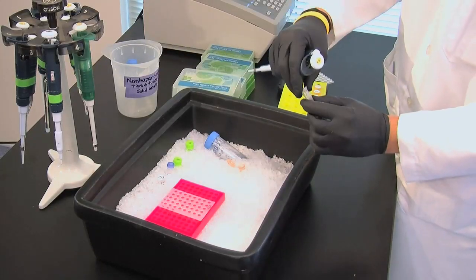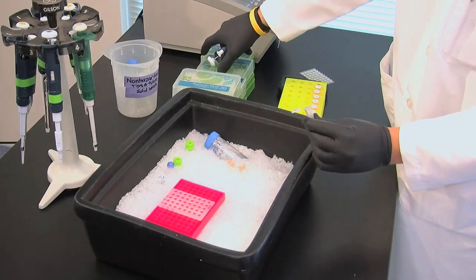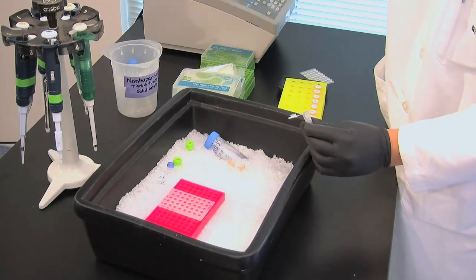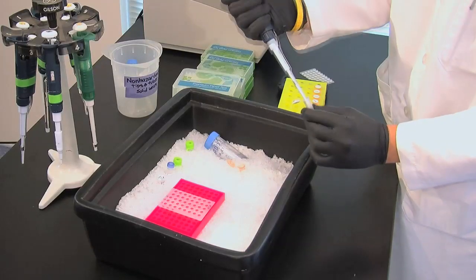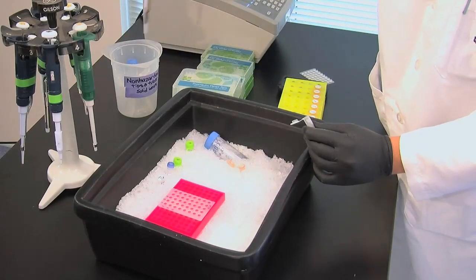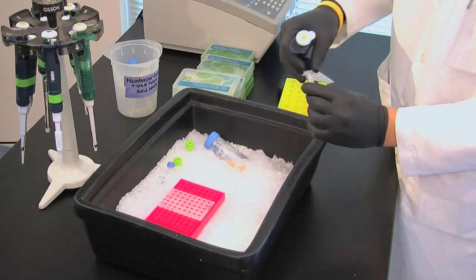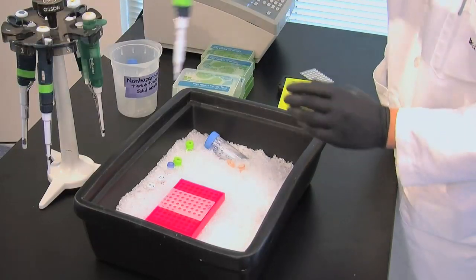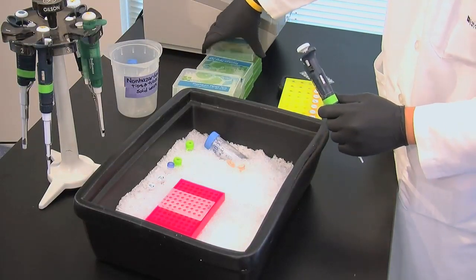Add reverse primers in the same amount as the forward primers, so 10 microliters. Add 2 and a half microliters of Taq polymerase.